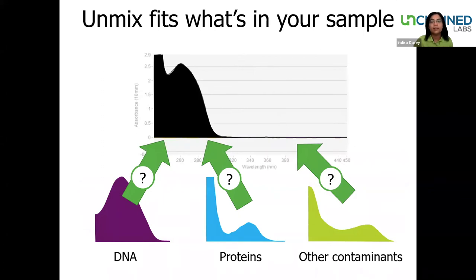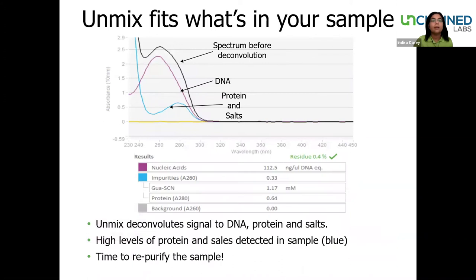In addition to choice of background correction method, Lunatic offers another advanced analytic capability called Unmix. What Unmix does is identify the presence of common contaminants in the sample. The software analyzes the sample spectrum, then applies specific algorithms that deconvolute that information to reveal contaminants based on their characteristic spectrum. Here's the result of a DNA sample analyzed with Unmix. The black line represents the spectrum before deconvolution. Unmix identifies excess protein and salts — that's the blue line shown here. In the results table, the salt present is identified as guanidine thiocyanate. This sample would likely have to be repurified before using it in a downstream application.